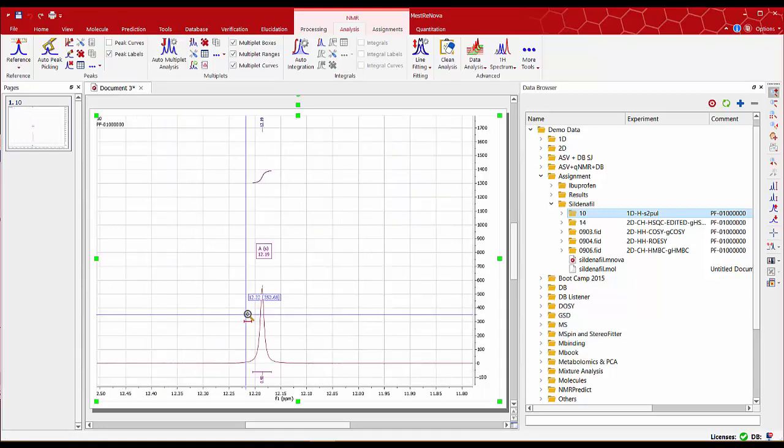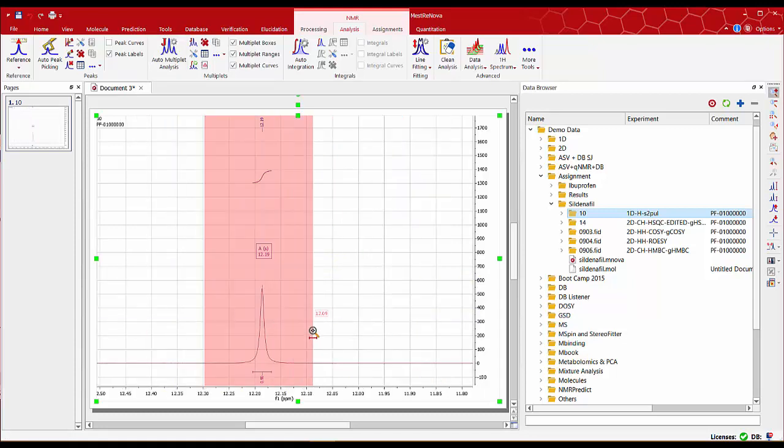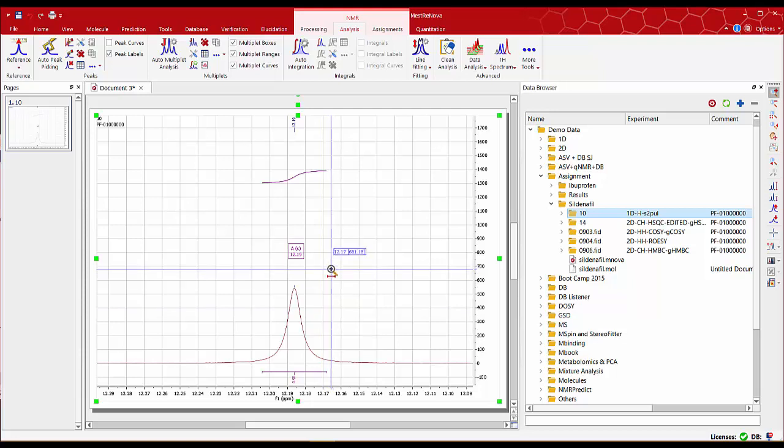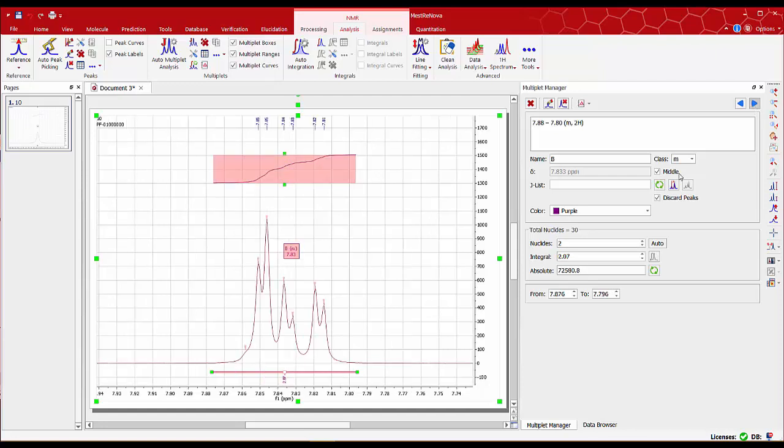Once the analysis is done let's zoom in on one of the peaks and double click on the box in the middle table to open the multiplet manager table and use the blue arrows to navigate through the different peaks to make sure the results are correct.